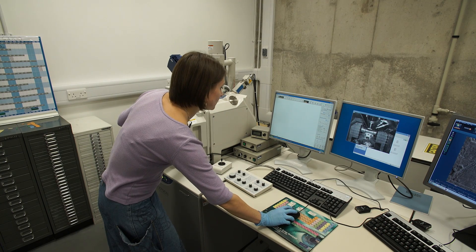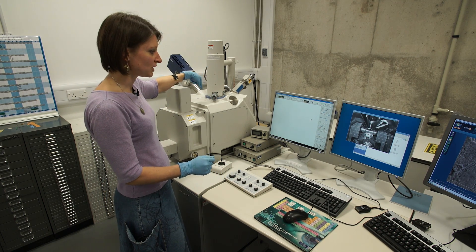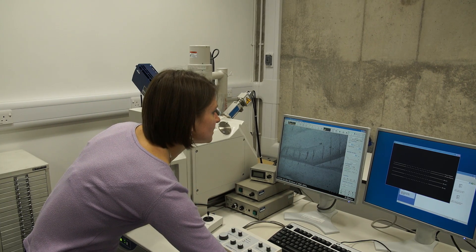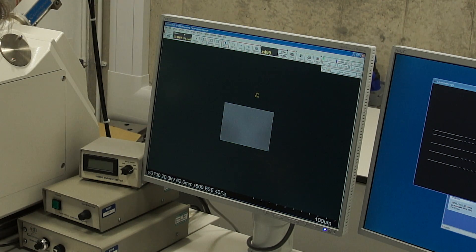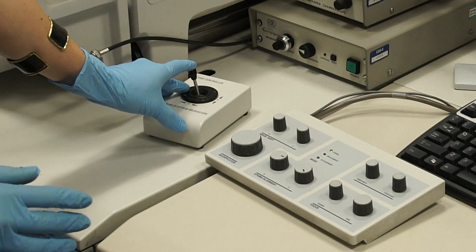It's ready now, so I'm able to switch on the high voltage — the incident beam of electrons onto the object to create an image. We have got a first image of our object. Then we get to a small area and get the image in focus as much as we can. We go higher in magnification and then we can move on the surface of the object.